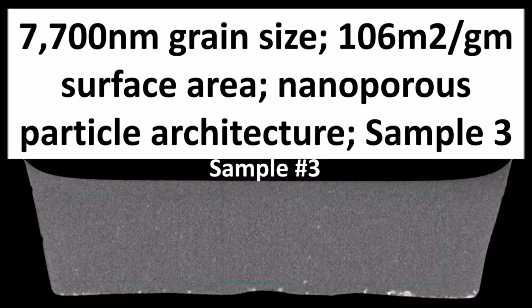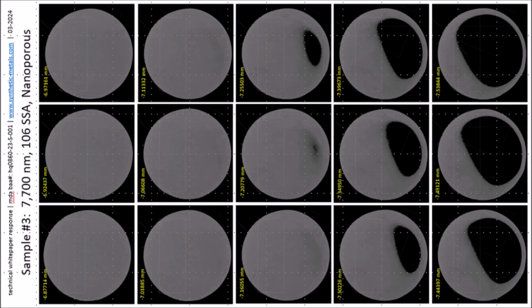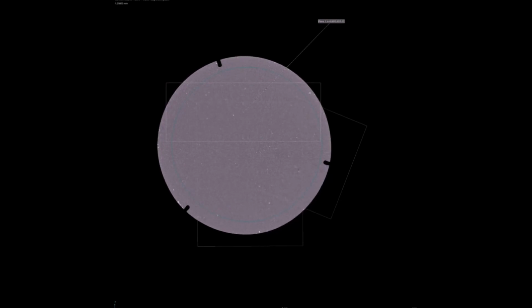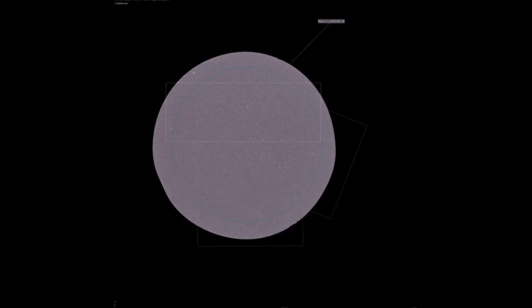Sample 3, 15 panels display. Here's the X-ray video, starts at the top of the mold, ends at the bottom. No white dot aggregation.